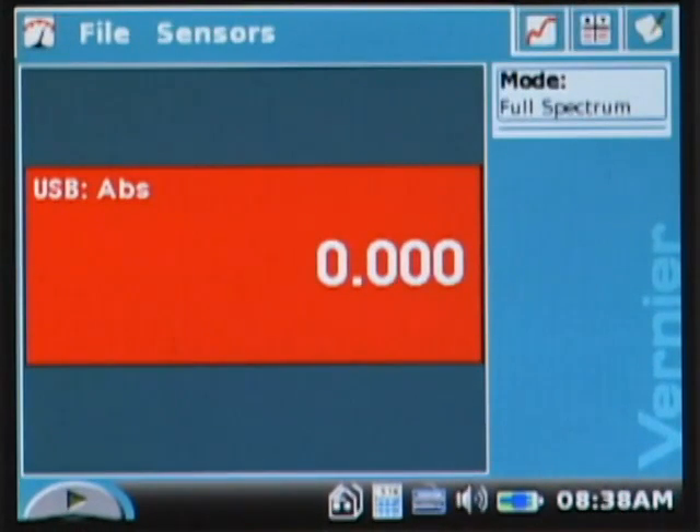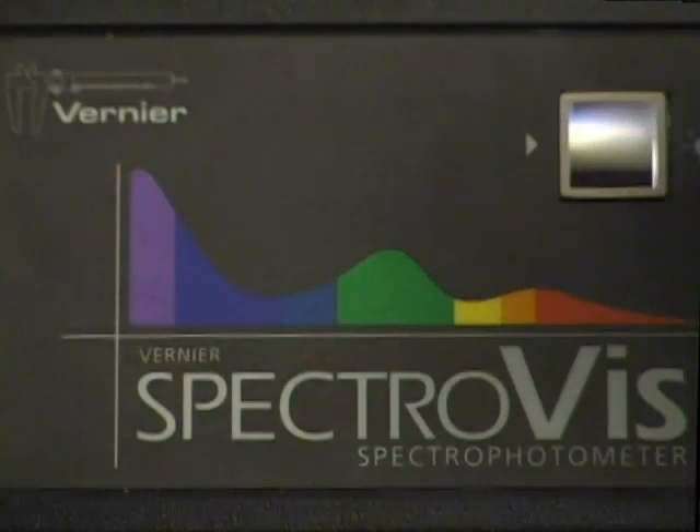Next we're going to determine the wavelength spectrum for crystal violet solution in order to know what wavelength to use in the experiment. This is where the SpectroVis gives us an advantage over a traditional spectrophotometer or colorimeter, where typically the student is told what wavelength to use — in this case they get to discover it for themselves. I'm going to place a sample of 2.5 × 10⁻⁵ molar crystal violet solution into the cuvette slot.